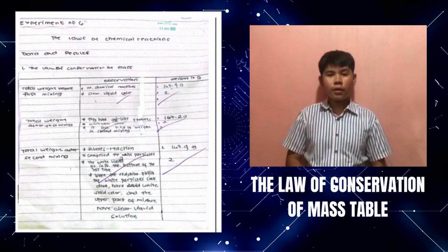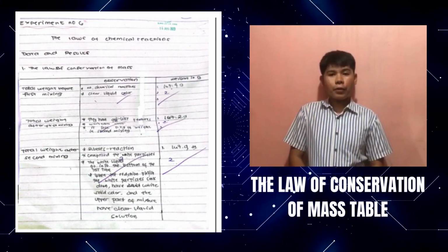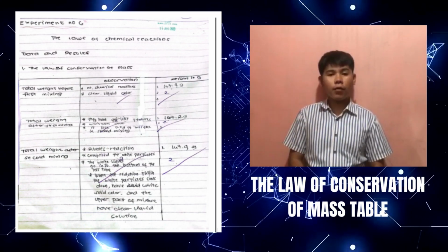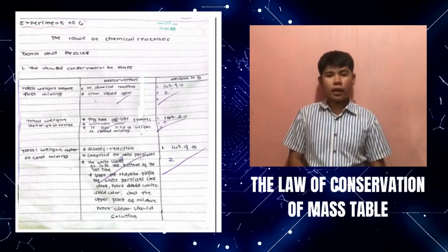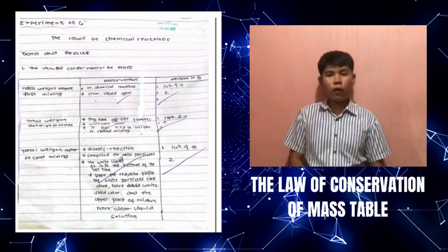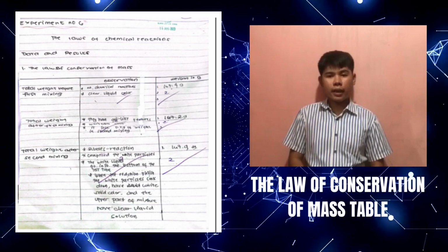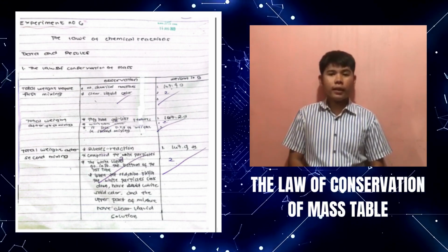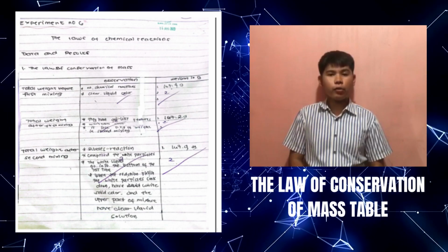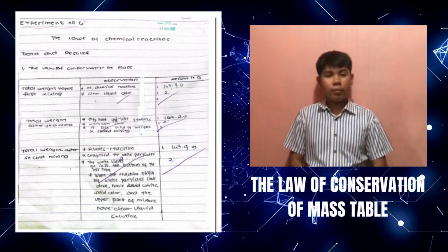The law of conservation of mass. Total weight before first mixing: no chemical reaction, clear liquid color. Weight in grams is 167.4 grams. Total weight after first mixing: they have gel-like features. Total weight is 167.2 grams. It loses 0.2 grams of weight in second mixing.